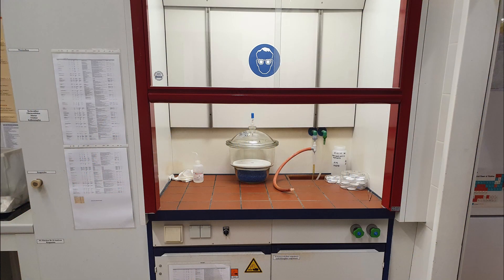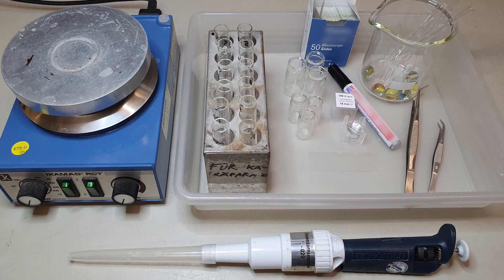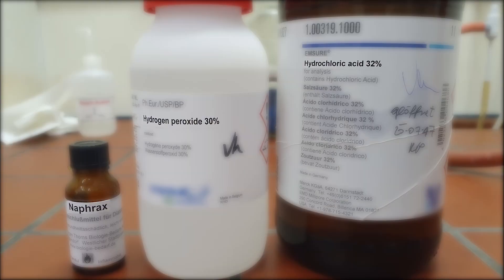Here is the most important equipment and material we are going to use: a fume hood, a centrifuge, a hot plate, a piston-operated pipette, and laboratory glassware shown in this picture. The required chemicals are 30% hydrogen peroxide, concentrated hydrochloric acid, and Nafrax as mounting media. In general, the method selection depends on the laboratory equipment and is upon the operator's choice.